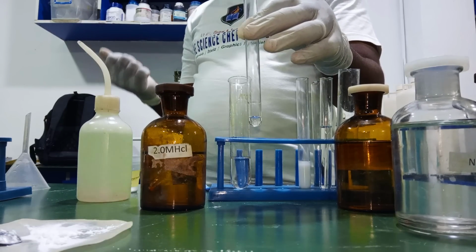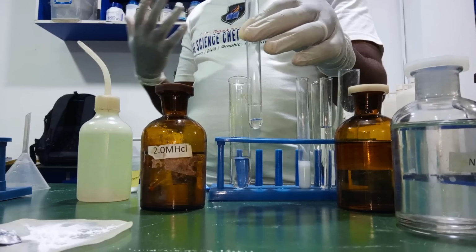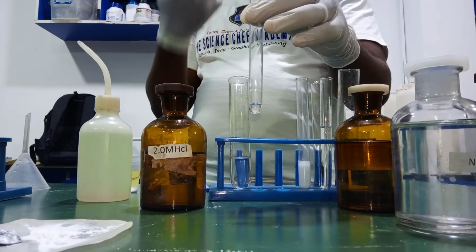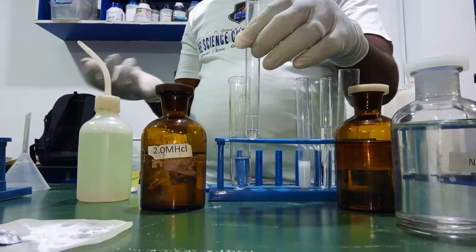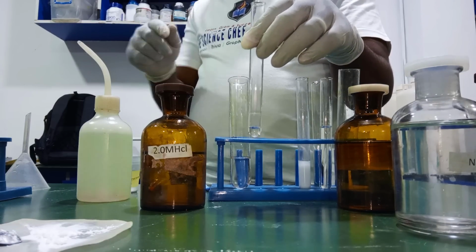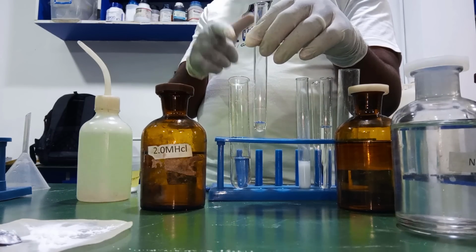but does not dissolve in excess ammonia is aluminum. And when you add dilute HCl to an aluminum salt, there will be no visible reaction, because aluminum chloride is soluble, right? So HCl is always used to distinguish between aluminum ion and lead(II) ion. So if we add this HCl to this solution and we get a white precipitate, that means that the cation present there is Pb2+ ion.